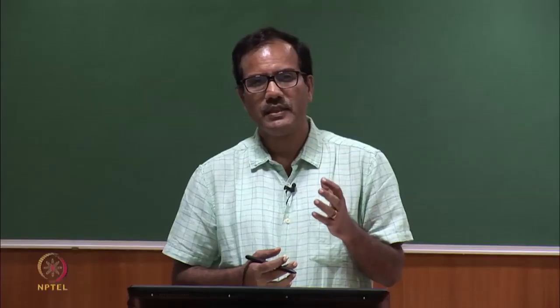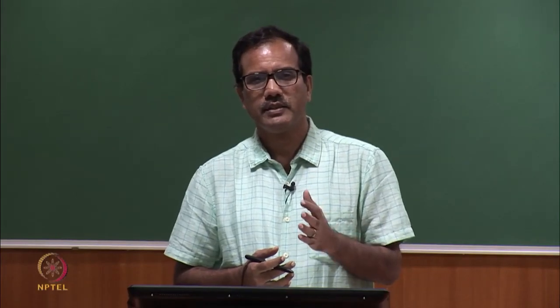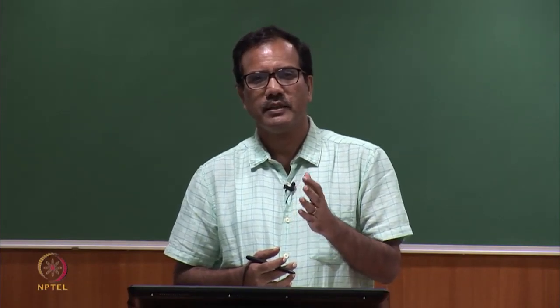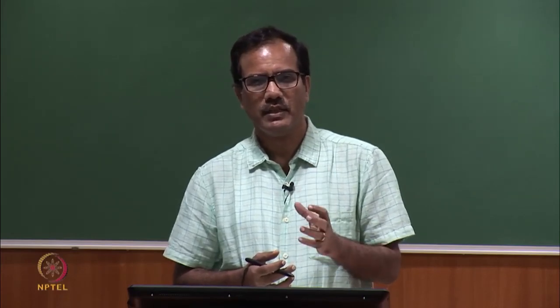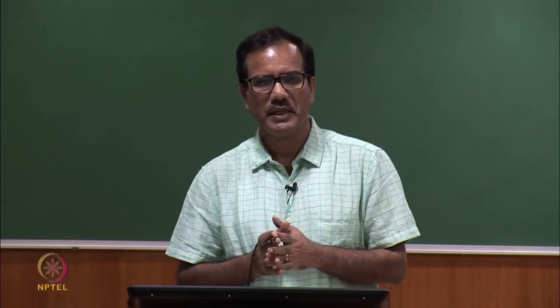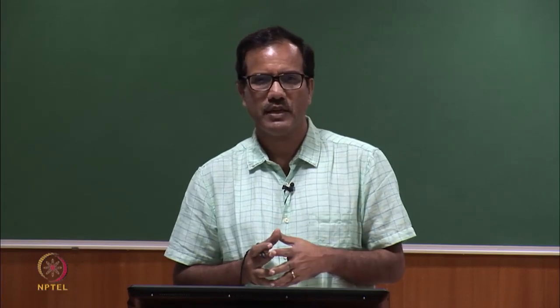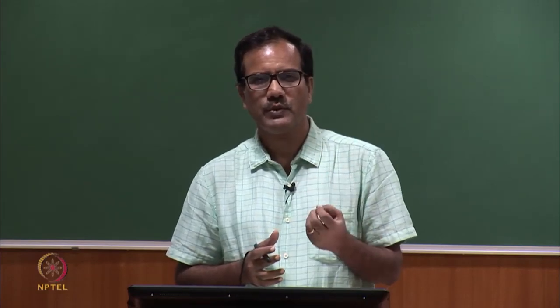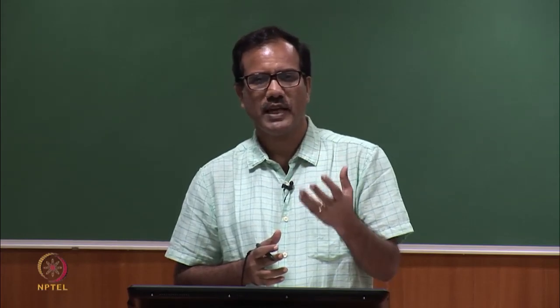So you can see how important fluorescence spectroscopy is in looking at the various events inside our cell, inside our body. It has many more applications. I have tried to show you some of the applications. I hope that will give you a flavor of how fluorescence microscopy can be used.